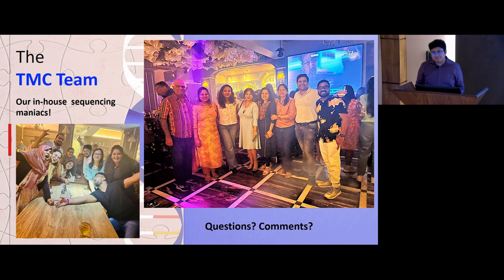Any question? Yes. I read many papers on ONT, sir. I came to know that there is some problem with the wax. Basically, if we are going through the block, if we are doing the liquid part, that is okay with the ONT. Correct. But many people are facing problems with the wax, sir. So is there any solution?